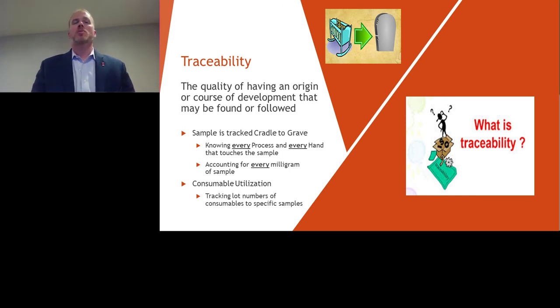So traceability is really important, especially in a highly regulated industry such as cannabis, and also other pharmaceutical-style analytics.